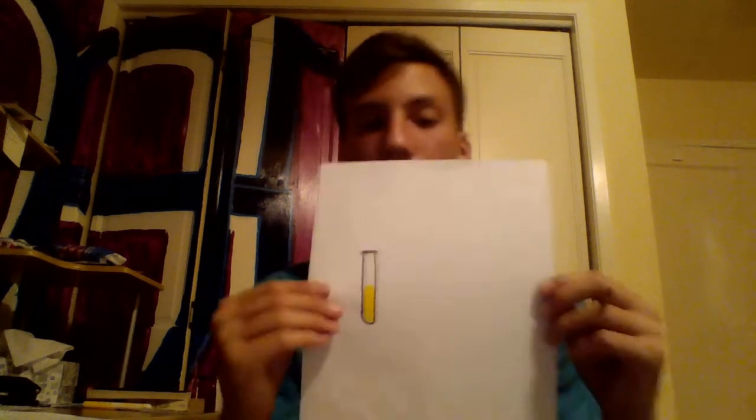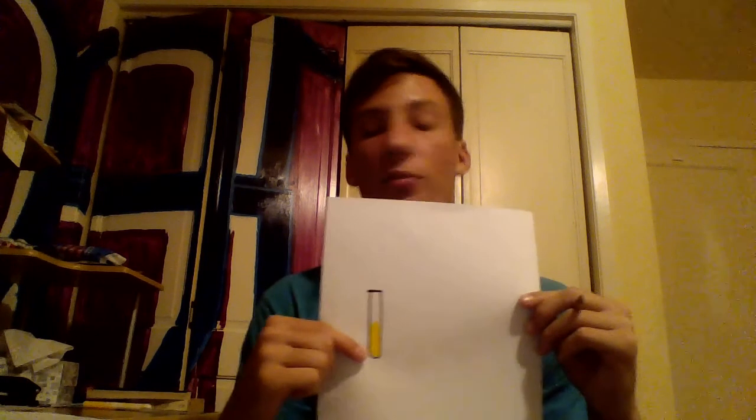So now that our colony is in there, we would put this test tube with the LB broth and our DNA in an incubator, and that'll allow it to grow, to amplify, to copy itself. And so after a day in the incubator, it'll multiply and grow exponentially.